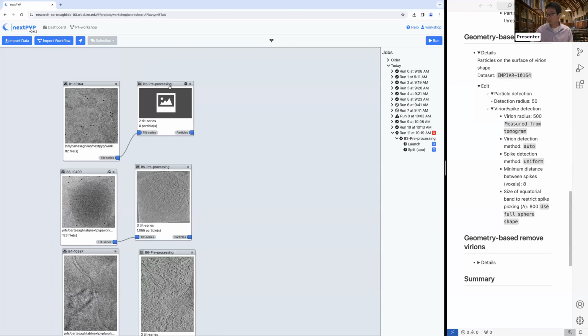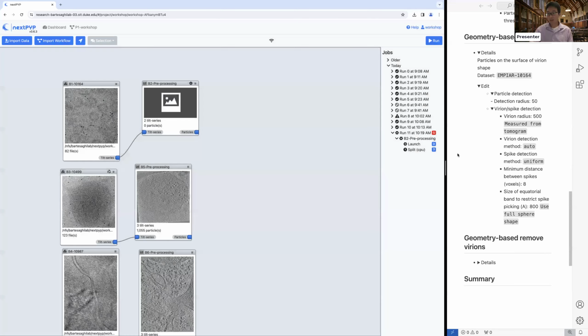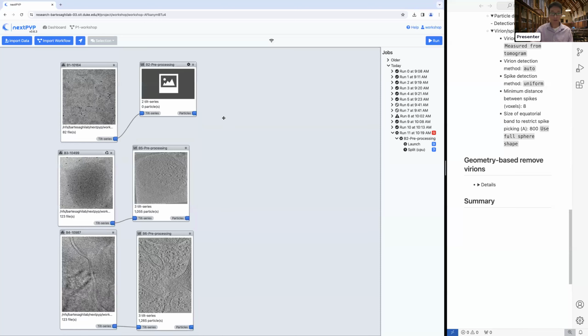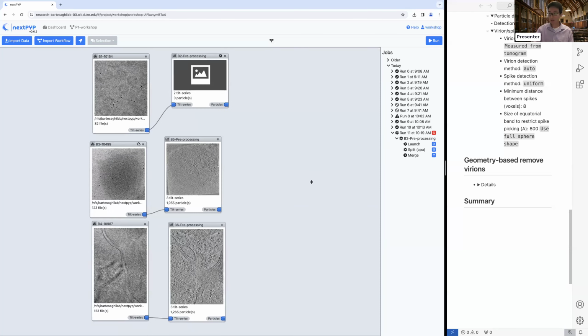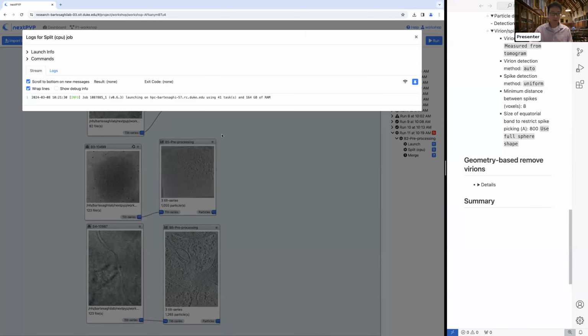While this geometry search method picking is still running. Okay, it's doing the right thing, I think. I think that's the last thing we need to wait and see if it does. All right. There's something else I should mention. All right, just trying to do the thing. We can follow the streams log information to check whether everything is really working.